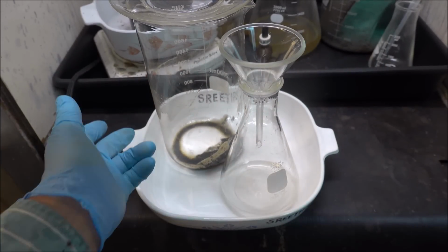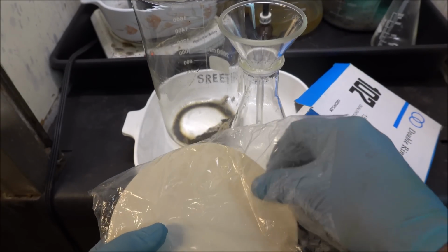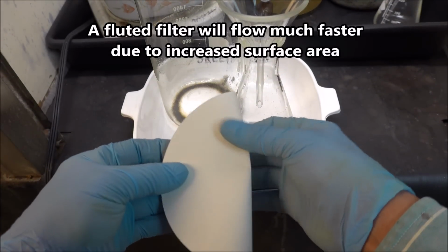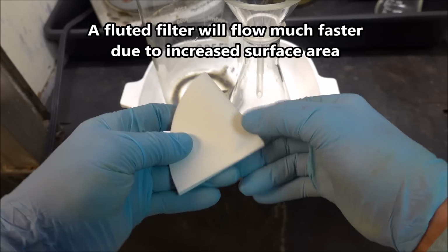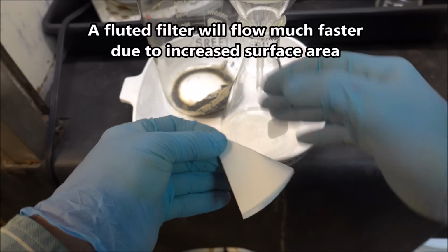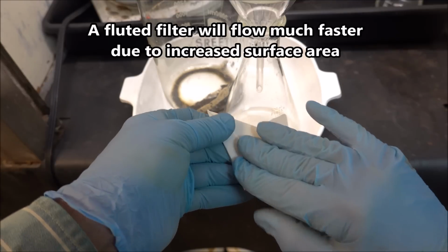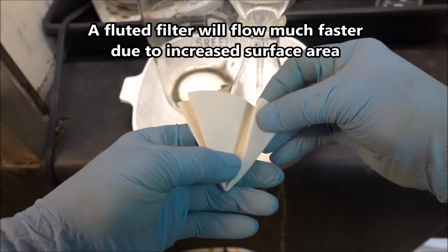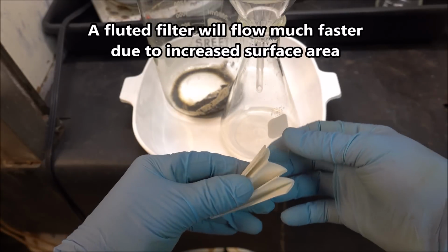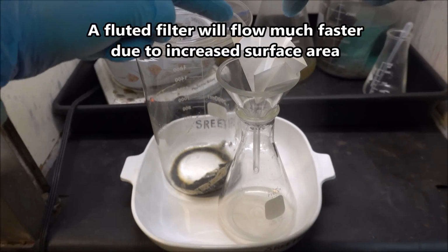Alright, now that we've made some room for ourselves, got that waste out of our way off the top of the jeweler's gold, I'm going to take a filter paper here, and I like to use a fluted filter paper. Fold it in half. Fold it in half again. And fold it back like we're making a paper airplane here. Fold it back again on the other side. Then again. Turn it over, do the same thing on this side. And we open it up, fold it in on itself on both sides, like that. And then crease it together like that. And we got a perfect fan fold filter paper. Put that up here in our filter. And we'll filter the gold out of this now into this paper.